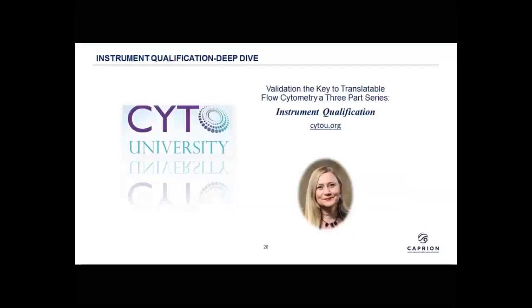For instrument qualification, I don't have time to talk about it today, but Cherie Green just gave an excellent deep dive webinar from ISAC at the CytoU, and there's a link for it here. And I apologize, but I will be pointing you to lots of other webinars today, and you can look at them or not, but just so you get a little more information on any topic. And Cherie's webinar was part of a 3-part webinar series that we put together for ISAC.